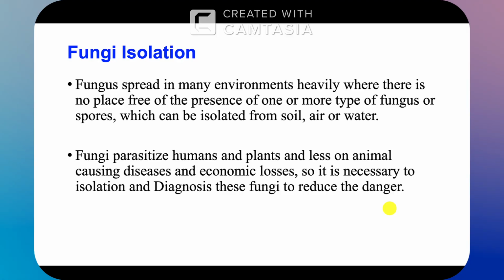Today our topic is detection of fungi from soil sample. If you remember, we previously had some topics and subjects about fungi in general, so mycology, and then fungal isolation and fungal infection, of course.